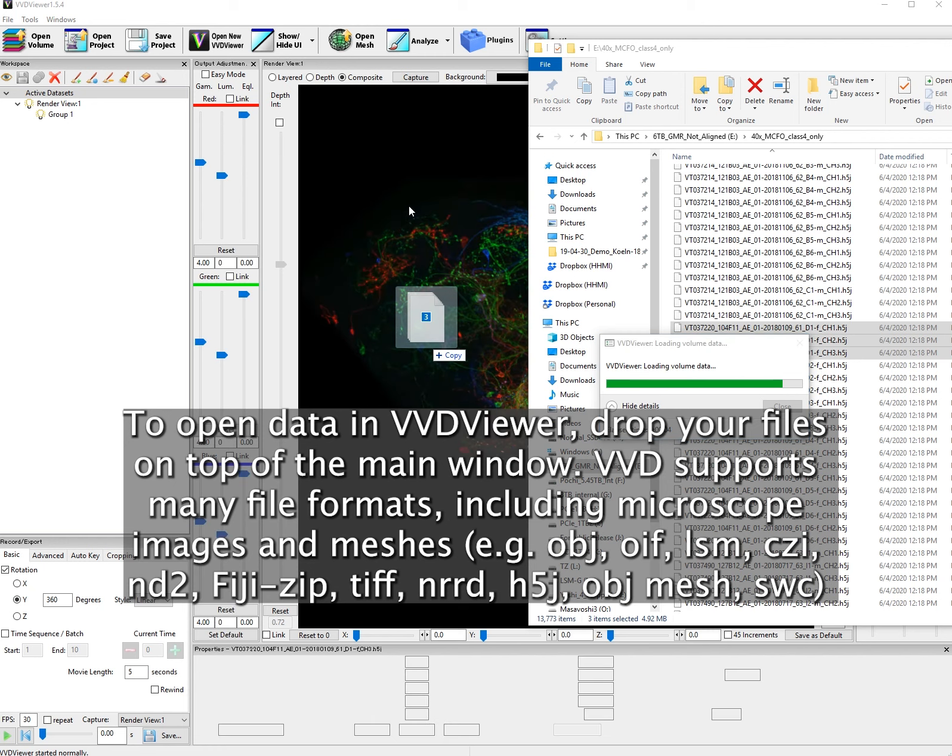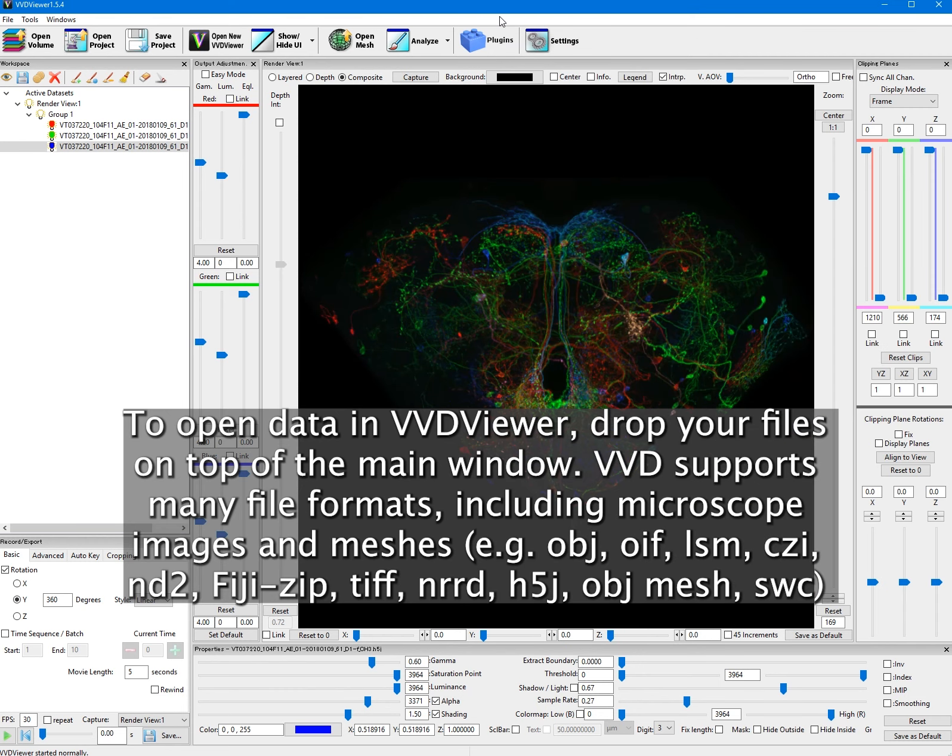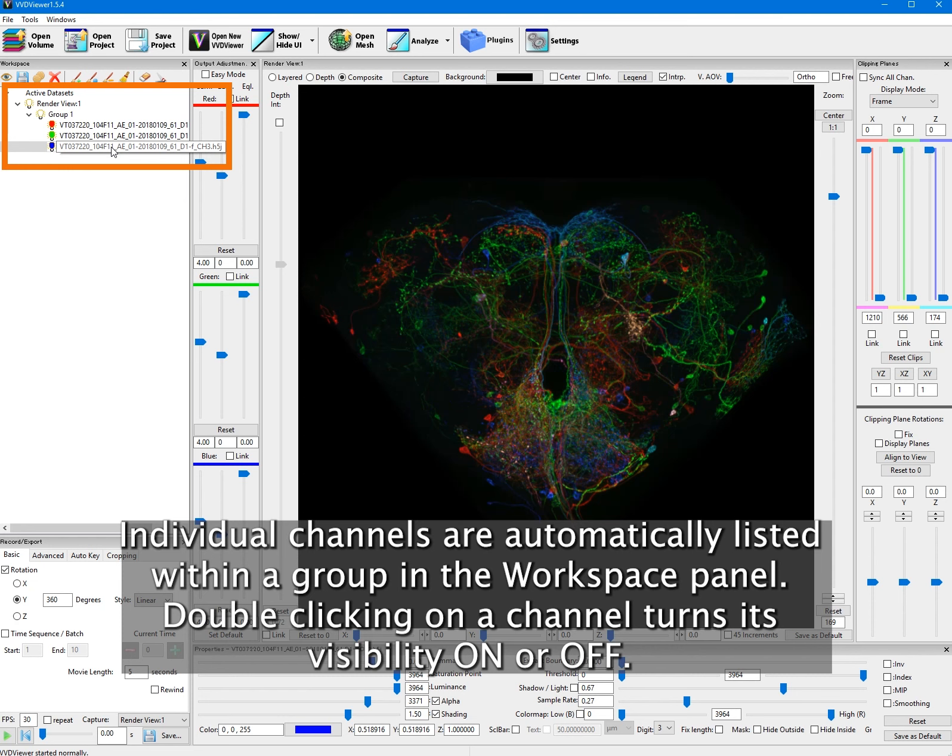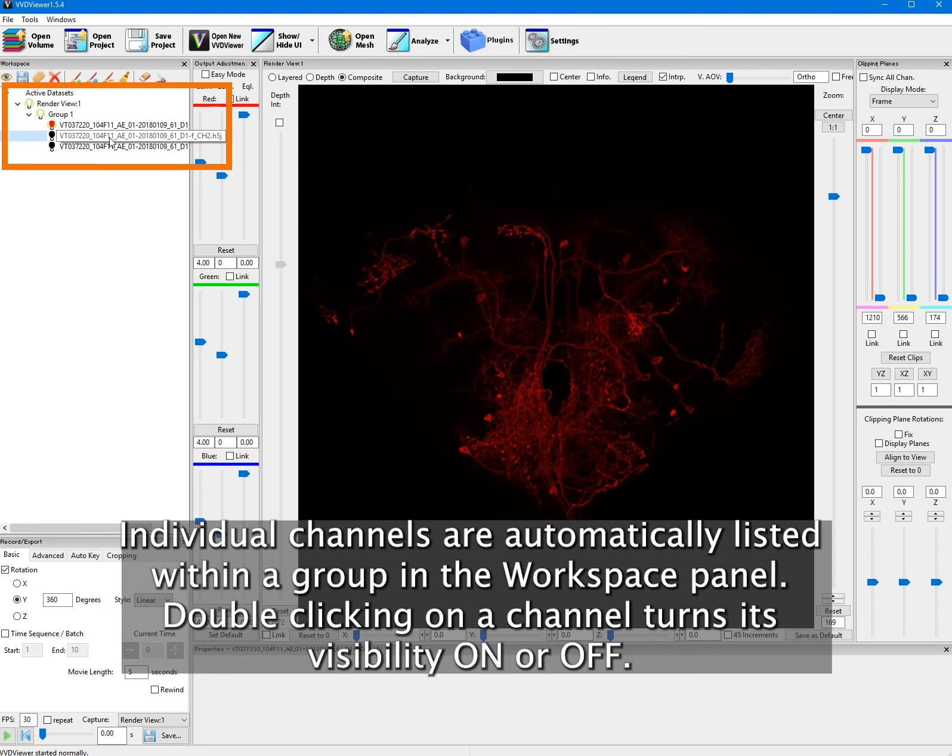For example, OBJ, OIF, LSM, CZI, ND2. Individual channels are automatically listed within a group in the workspace panel.